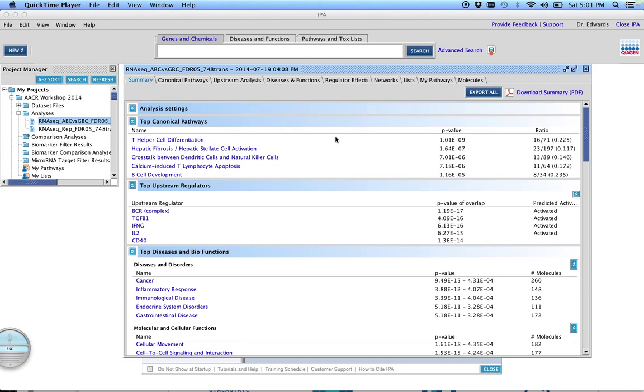Our first tutorial, what we did was download our gene list. This was a list of genes different between two different forms of B-cell lymphoma, one more aggressive than the other. So in this tutorial, we're going to talk about how we explore this list for pathways.